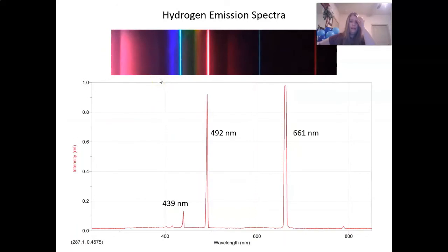So I grabbed a screen cap from the video just to remind you of what you were looking at. This pink color was the pink color of the light itself. And then you can see the 2 lines. And out here where the diffraction grating repeated, those 2 lines, the teal and the red line. So we know that thousands of electrons are dropping from a higher energy level down to a lower energy level, and they're releasing energy, which is what we're picking up as this emission spectra.